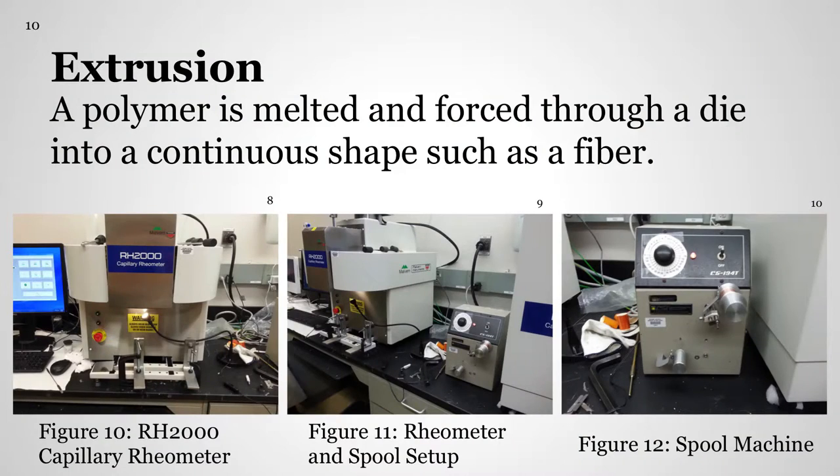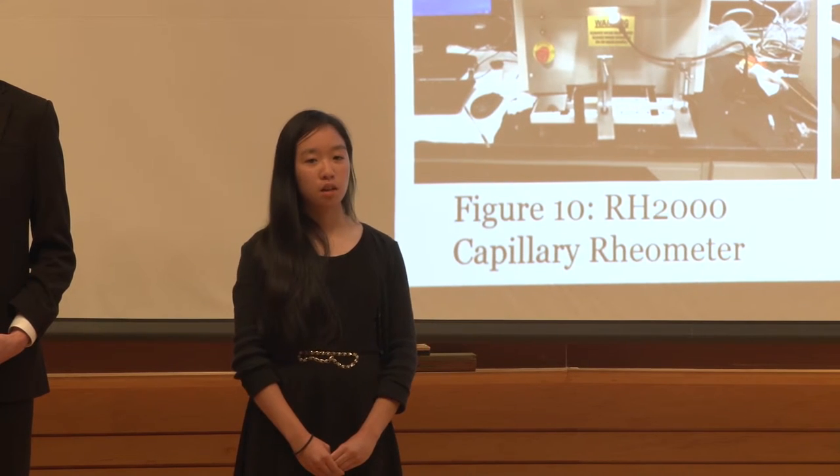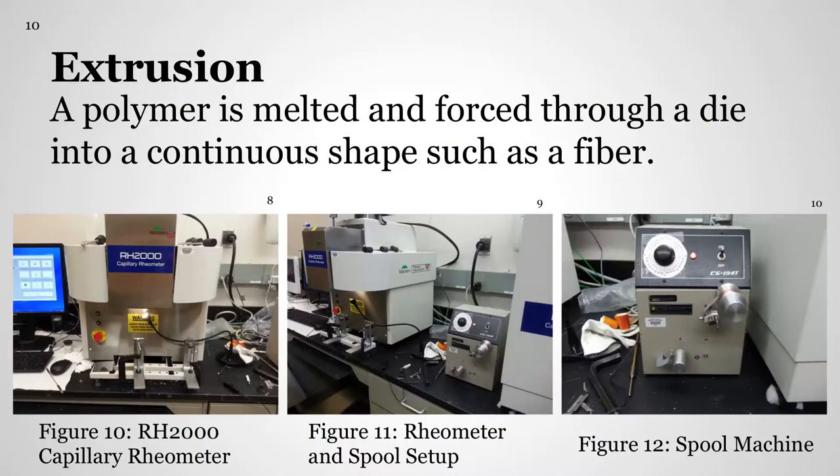So the process we used to fabricate the fibers was extrusion. Extrusion in general is used to create objects that have a consistent cross-section throughout their entire length. In our experiment, we first dried PLLA pellets and then packed them into a rheometer, shown in this image here, and the rheometer heated the pellets until they melted.